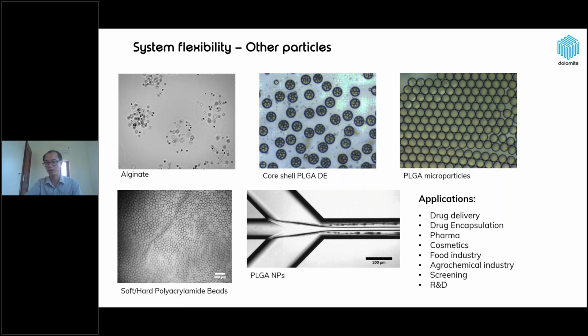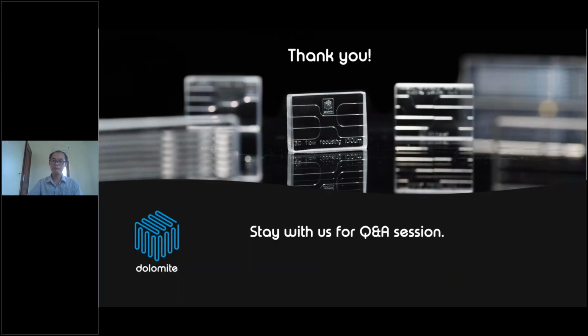It's used for many applications like drug delivery, drug encapsulation, the pharmaceutical and food industry, or screening R&D. Okay, so I've finished the presentation today.